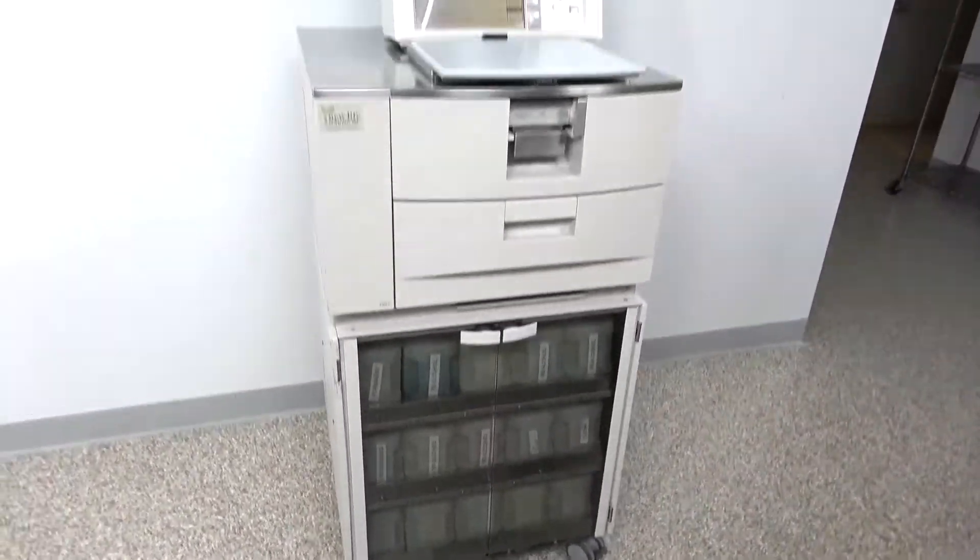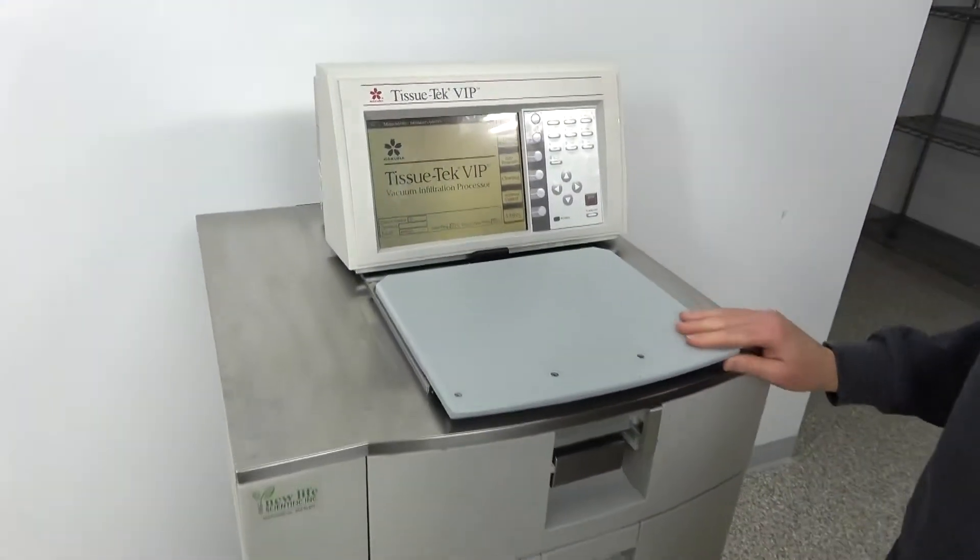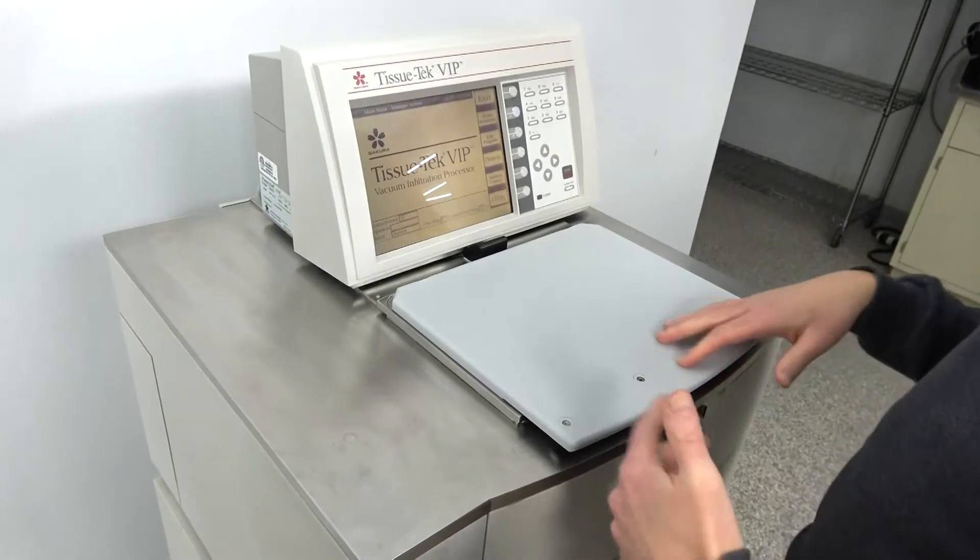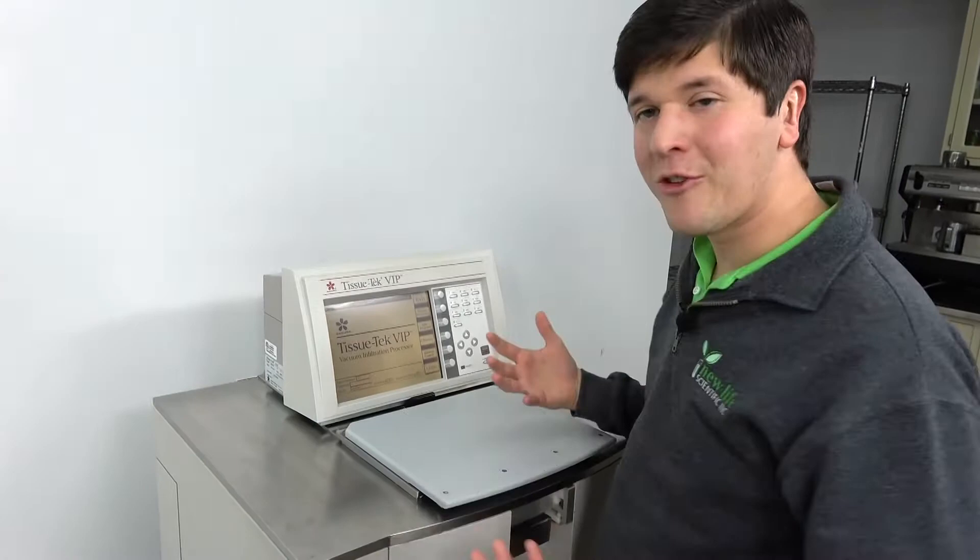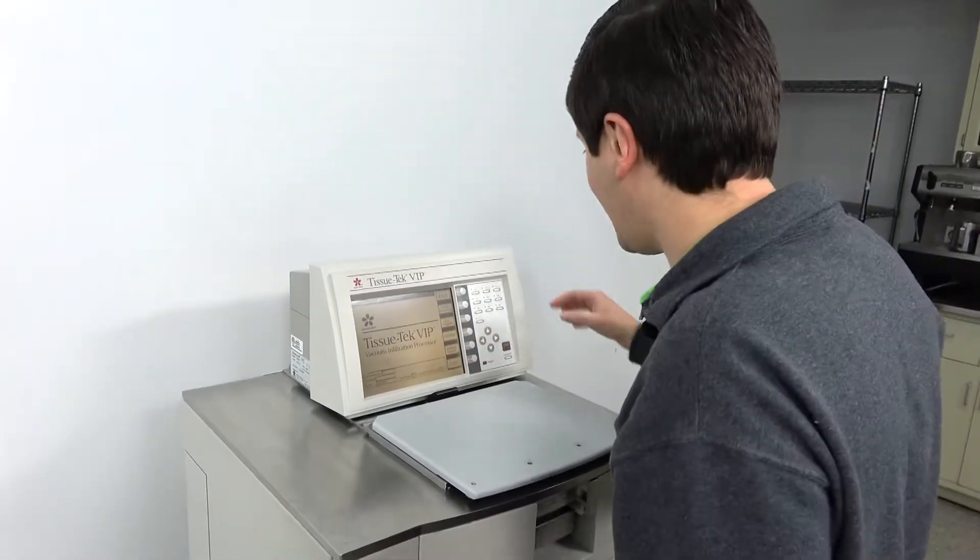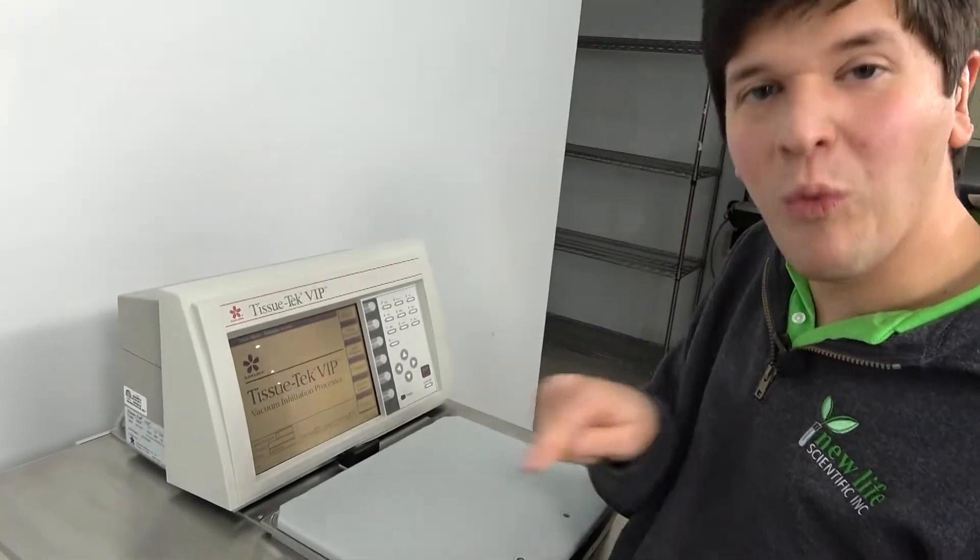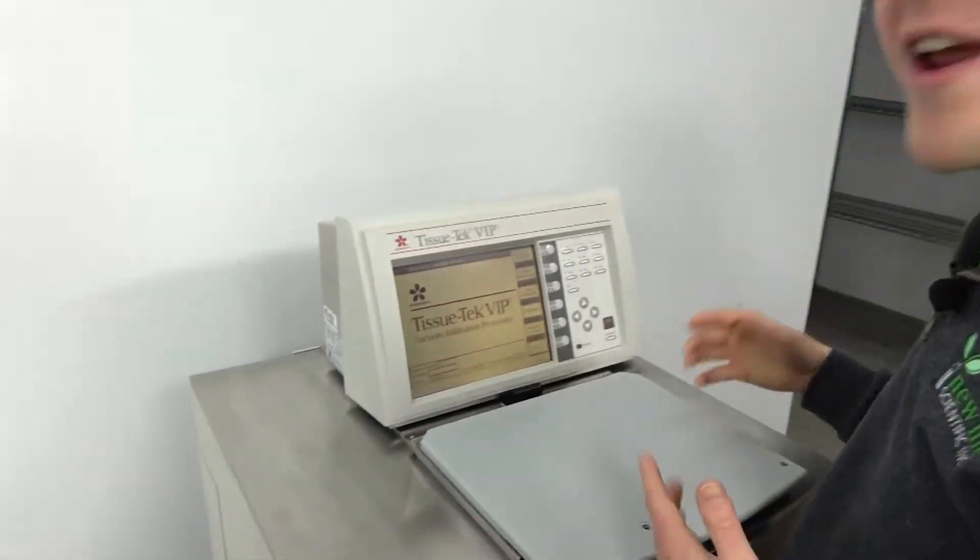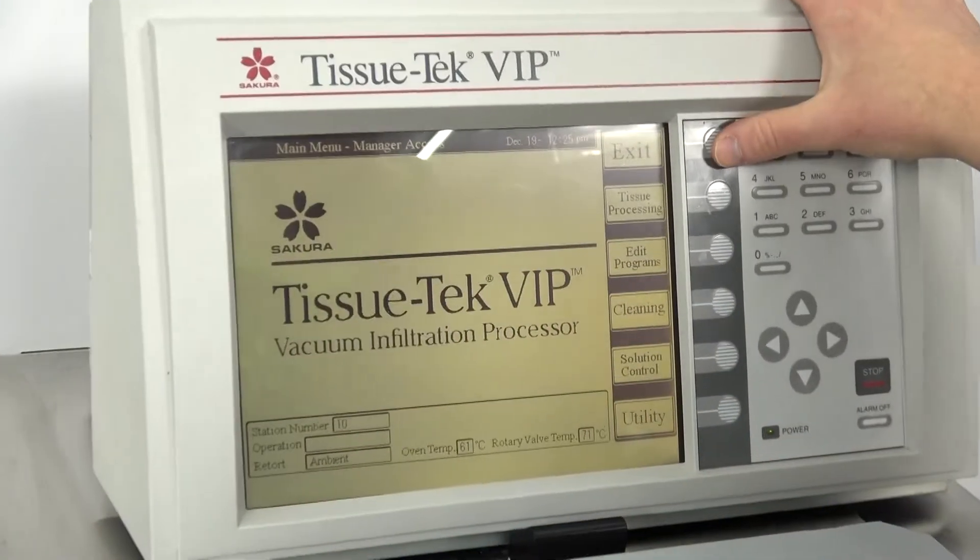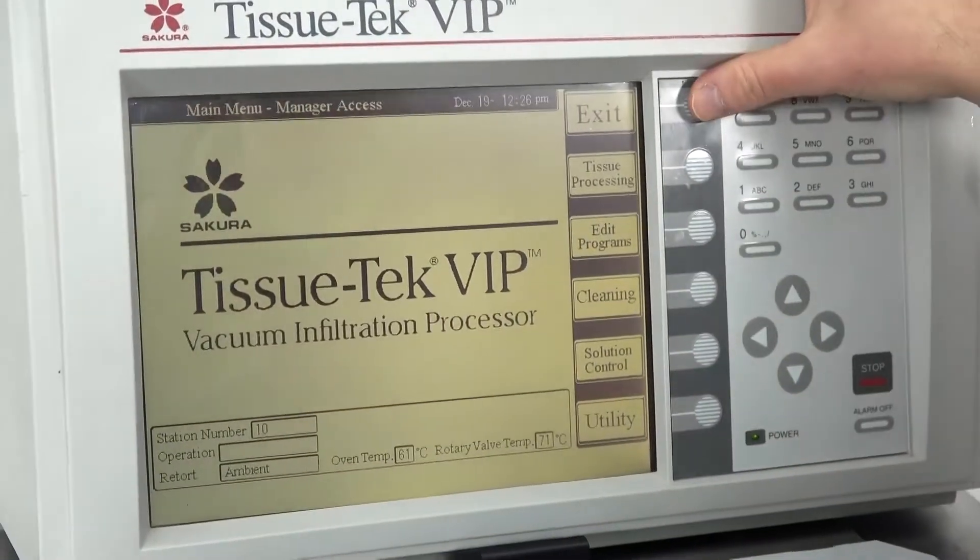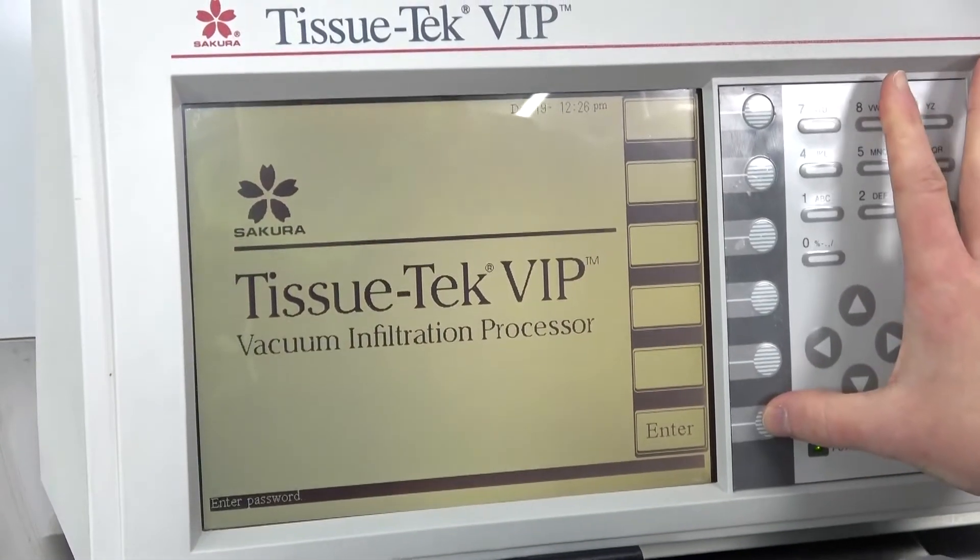For those of you that aren't familiar with the features of the VIP 5, I understand that this is very much a similar schema as the VIP 2000 or the E300, but they're just way easier to use. You've got buttons instead of a manual that you're trying to figure out what numbers to enter in. You've got a screen with buttons on the side, so there's not too many shocking surprises here, but there are some great features.